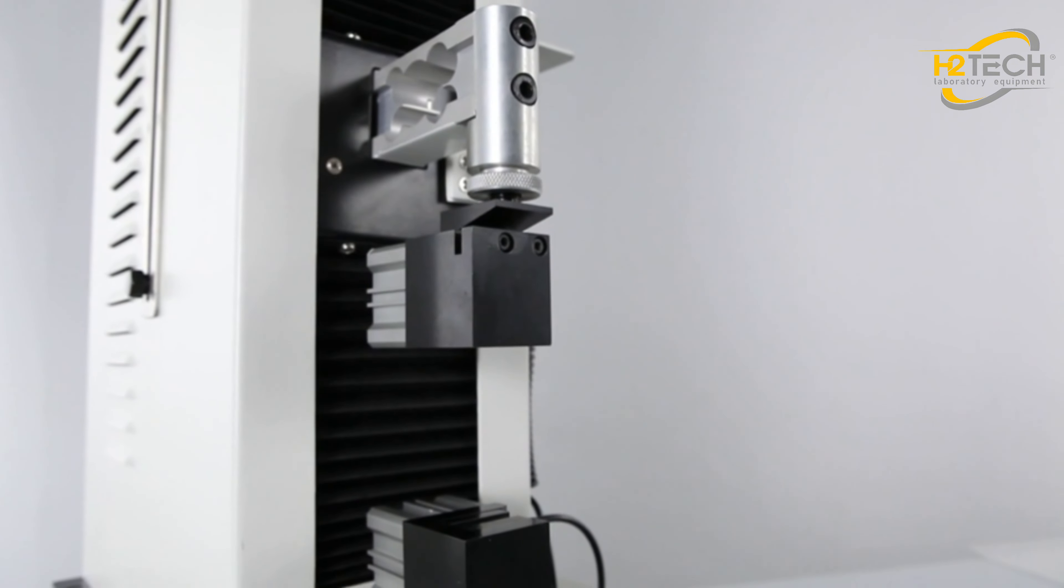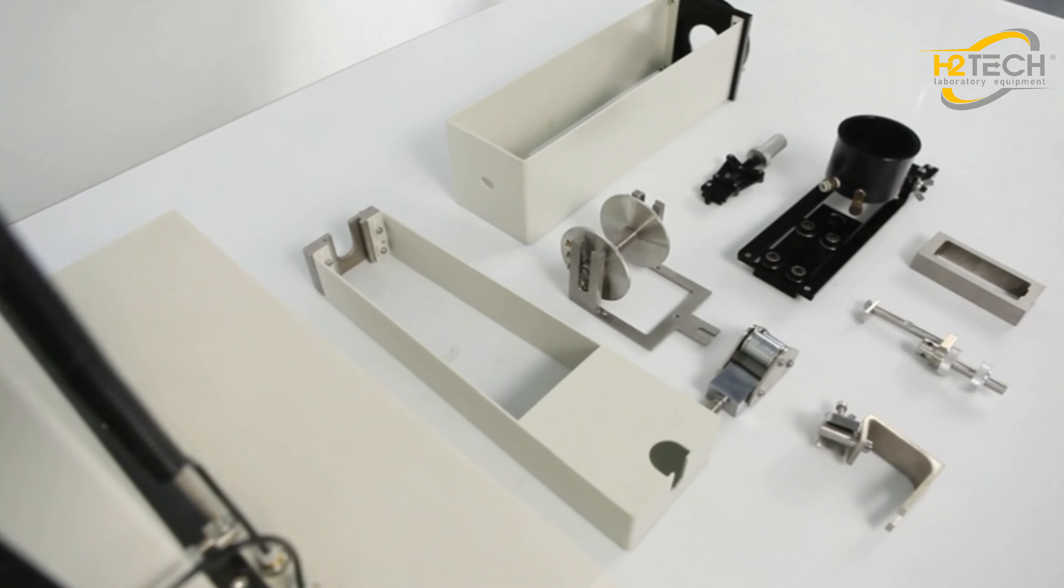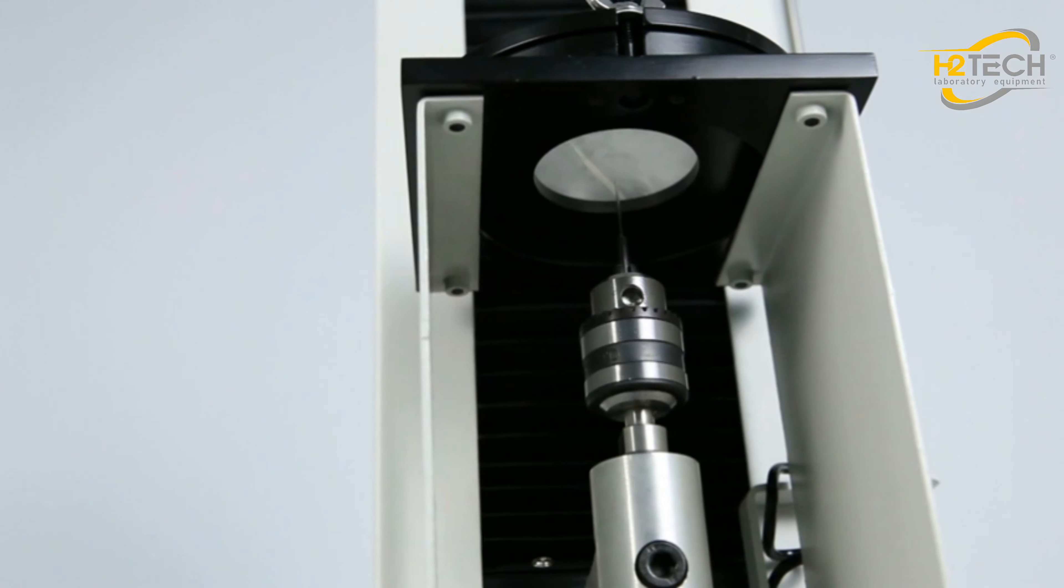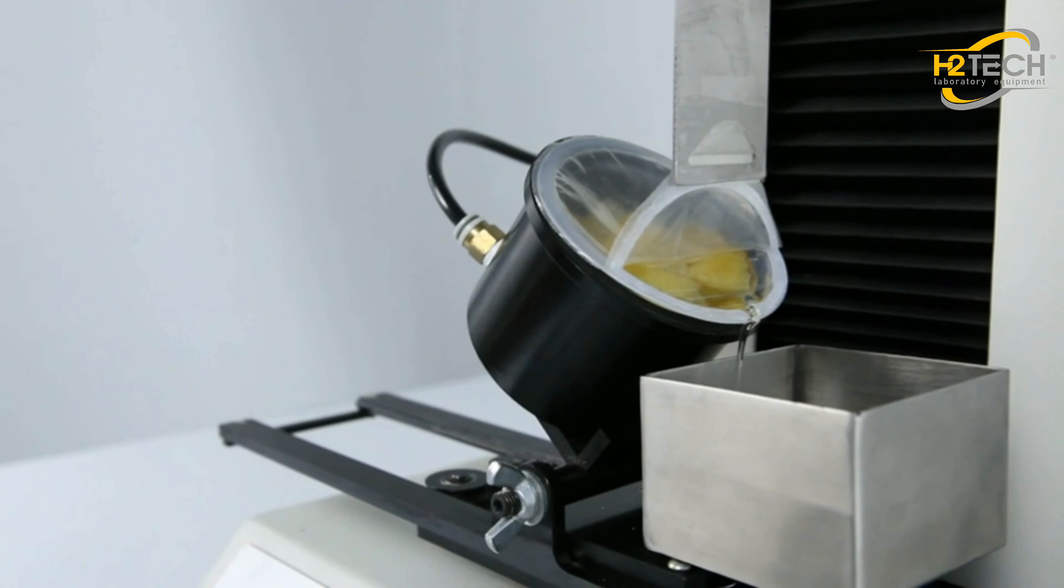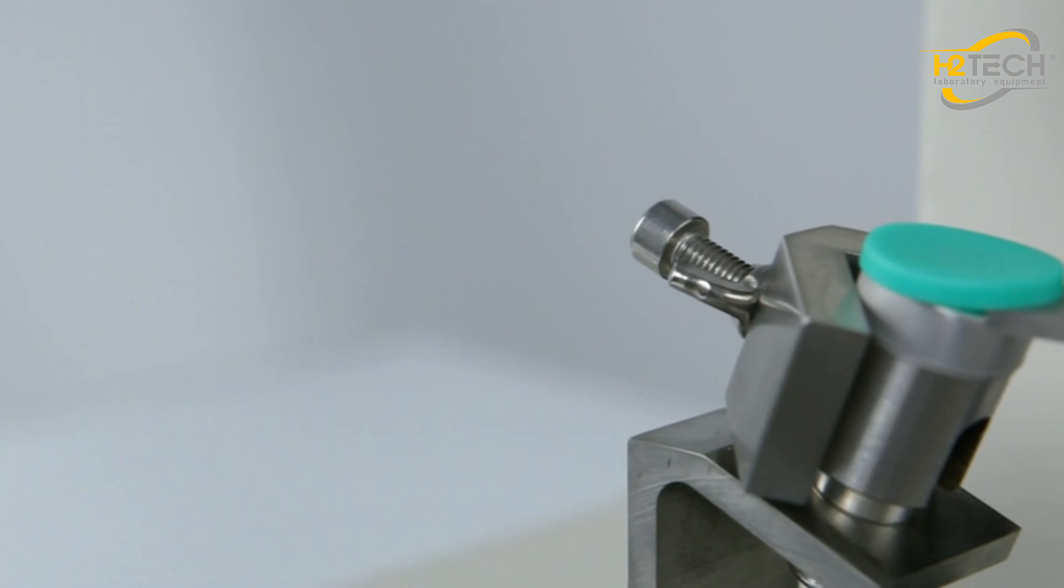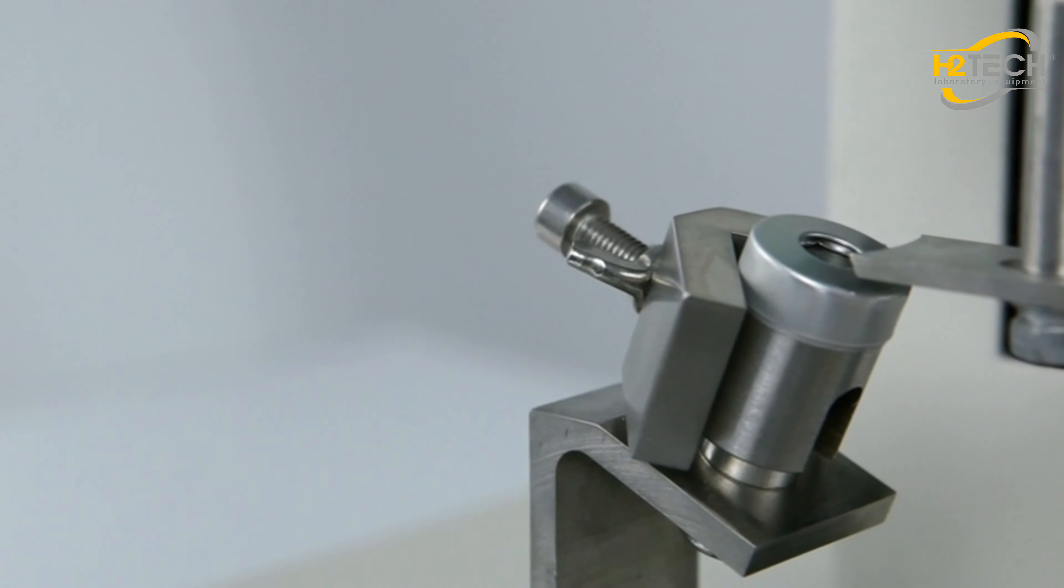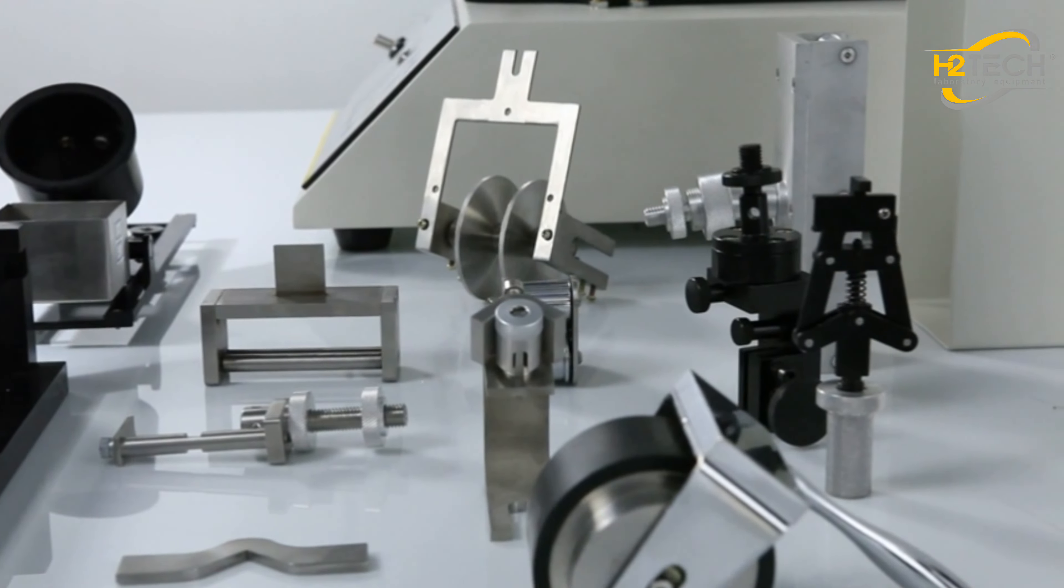With customized testing fixtures, this tester can be expanded to perform a variety of other special tests, such as puncture resistance of films, opening force of jelly cups, peeling force of release paper, opening force of caps made of aluminum plastics combinations and many more, becoming a multi-functional tensile tester.